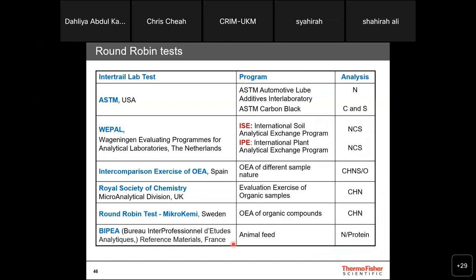When we are correcting our results, or when we are publishing our result in a journal publication, you always need to refer to a certain international standard, what we call a certified reference material. So imagine today you are starting a project. Your project is to determine CHN content in soil sediment. Okay? So you collected some samples, you did your thesis, you did your project on this soil, and you want to publish your result. To improve your publication, to improve the amount of citations, you will need to correct your result to an international standard. That means it's better to purchase a reference standard, run it on the same method, and make sure that you can achieve the acceptable range.